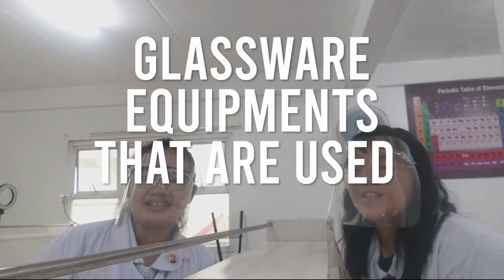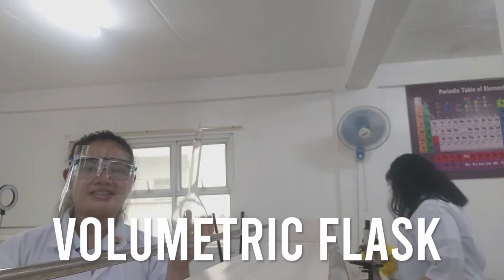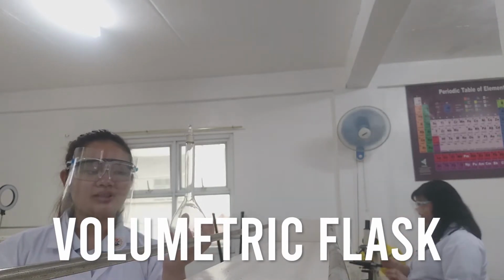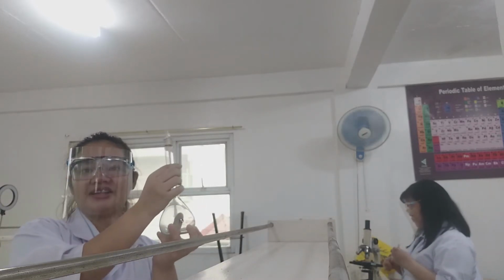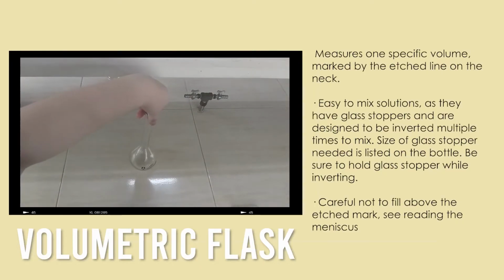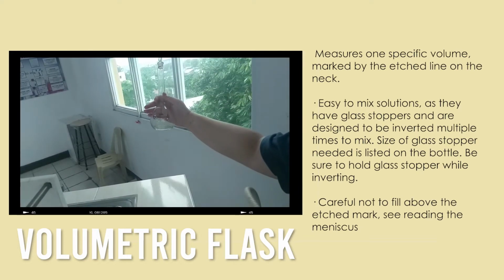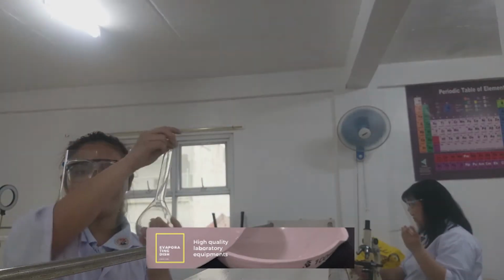Glassware equipment that is used for measurement. First one in this category is the volumetric flask. This flask measures only one specific volume that is marked by the etched line on its neck. The great thing about this flask is that it can easily mix solutions well, as it has a glass topper that is designed for it to be inverted multiple times.